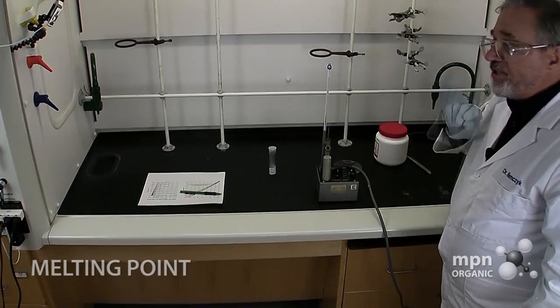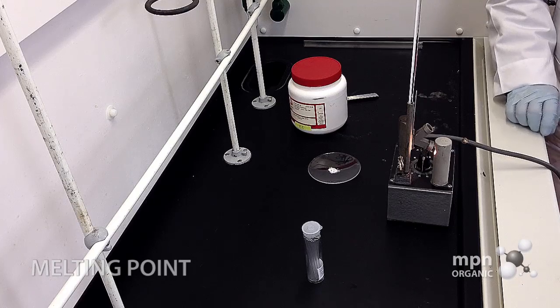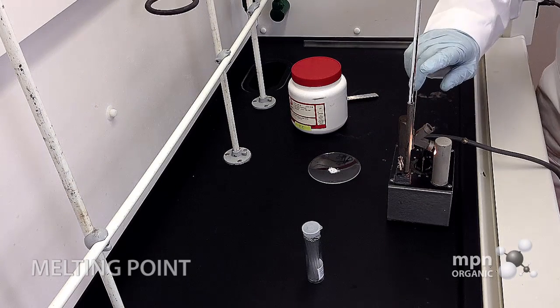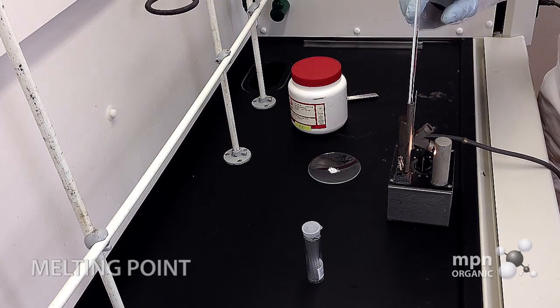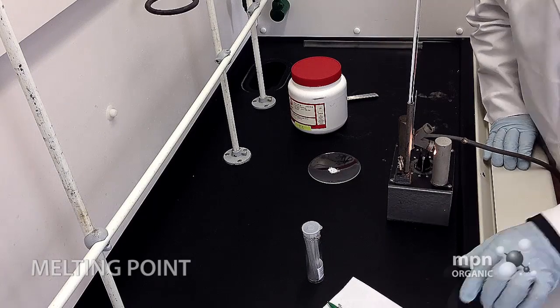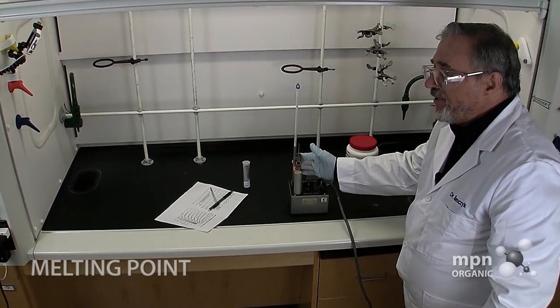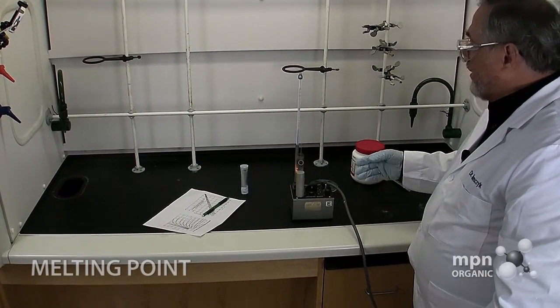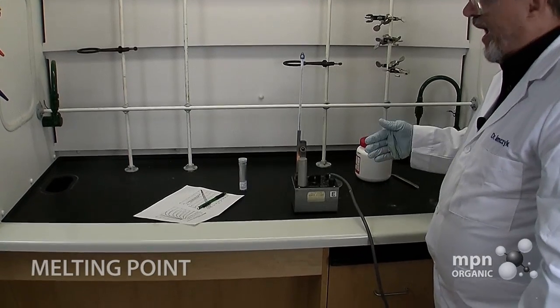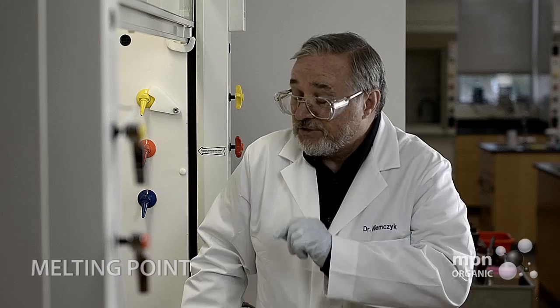I've got the sample in the sample holder, and I turn the thing on. And it's now at 20 degrees, but eventually it's going to get up to, according to my chart, 101 in 30 minutes. Now this demo is not going to last that long, obviously, but what will happen is the aluminum block will be heated. It's already starting to feel a little bit warm, and eventually it's going to get hot, so hot that you can't just put your hand on it. You could get burned. In fact, you've got to watch yourself with these.